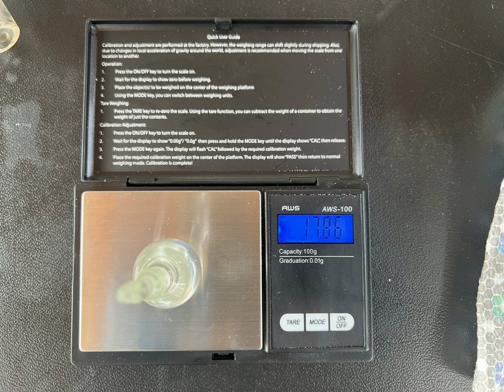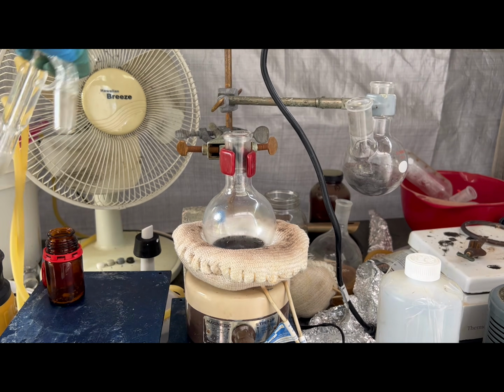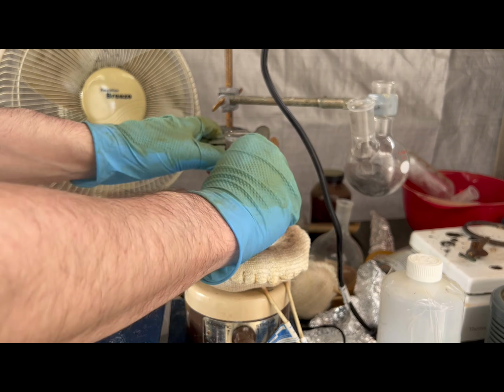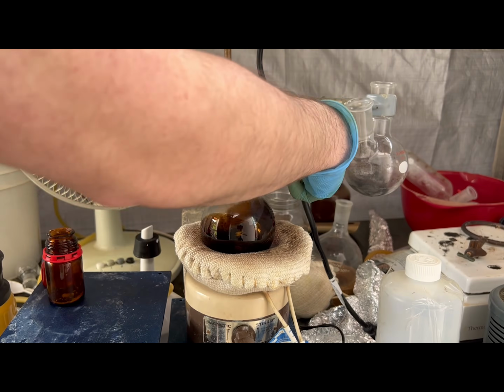The capillary in the stopper wasn't filled all the way like it should have been. This slightly altered the measured specific gravity, but not enough for me to redo it properly. I'll break all of the results down later in the video.